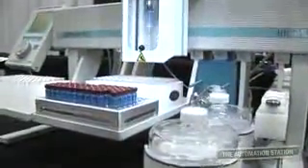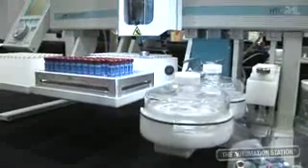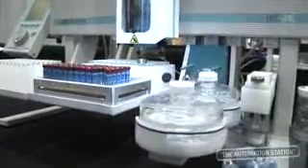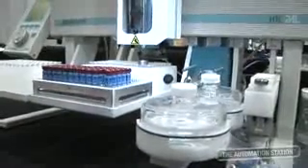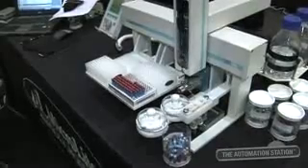We found urine to be a great platform. Blood, plasma, and serum has to be cleaned up before we can use it. It's good for any kind of water analysis, things of that sort. QC of raw material and finished goods is another application. What you saw there was we actually did the elution into that well. We discarded the device because you no longer need it, and it will pick up and inject right onto the valve — elute or inject onto the valve. Within the analytical run time of the instrument, we are prepping the next sample. It is serial but there is no downtime basically except for the first sample prep. And there's the final injection.